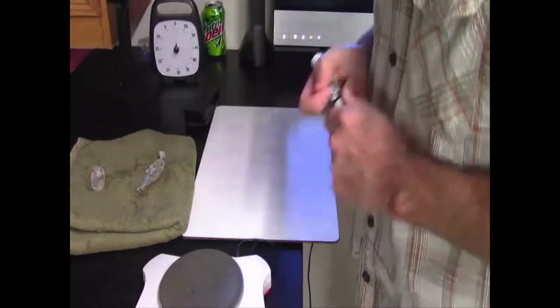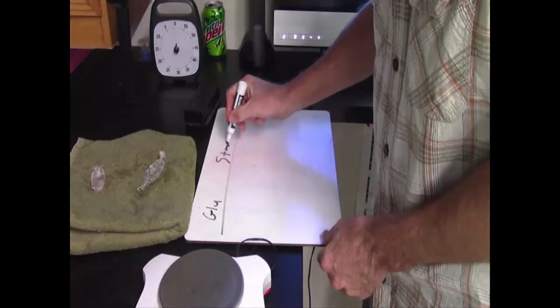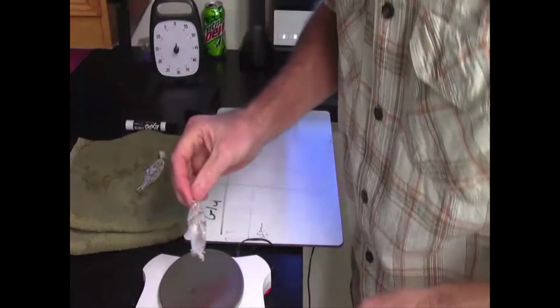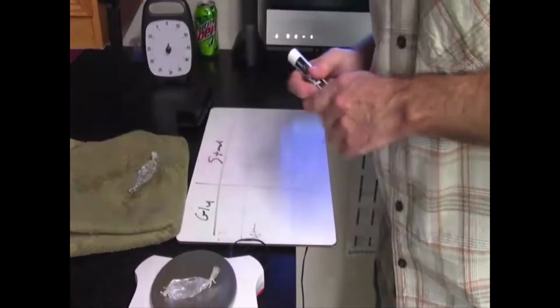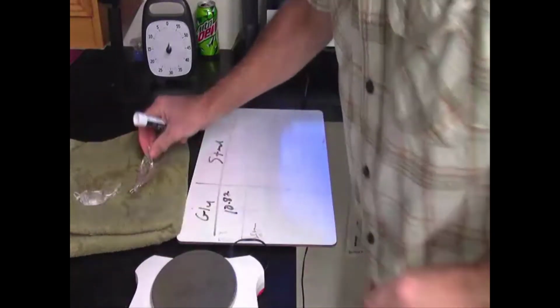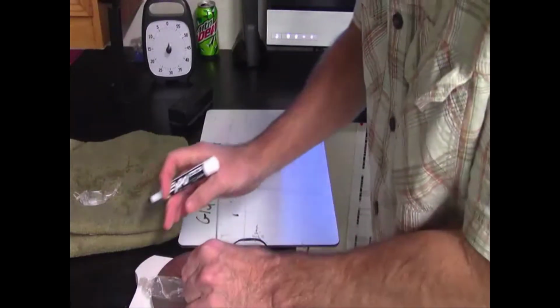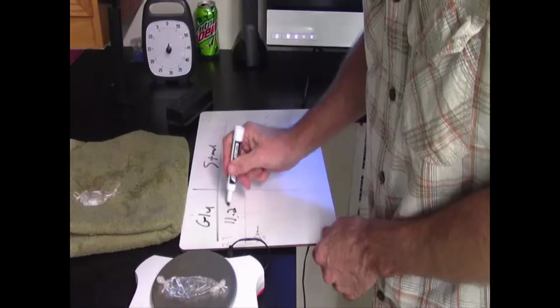Okay, so I have my 2 cells, and I'm going to write on here the glucose and the starch. And this is before, and this is after. Right. So I'll take the starch bag first, weigh it, and it is 10.82 grams. And the glucose, oops, I put it on the top, 10.82 on the starch. And the glucose cell is 11.28 grams.